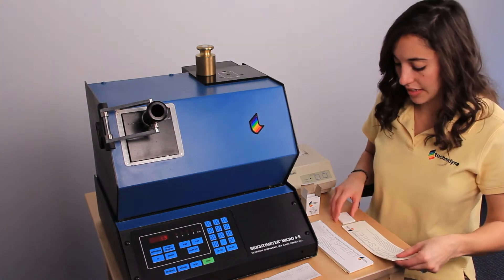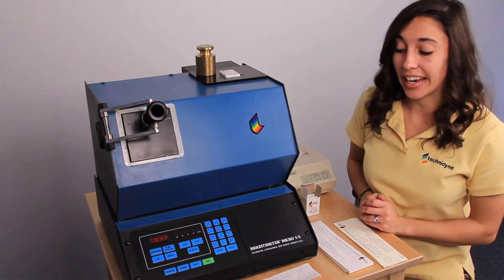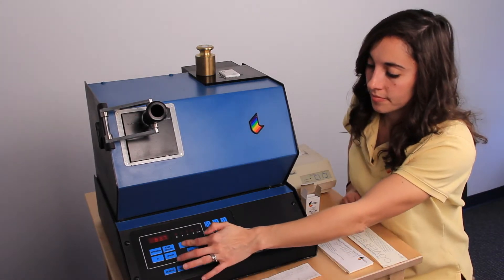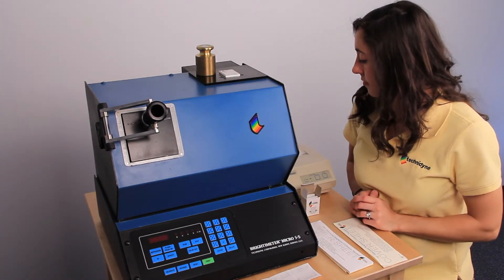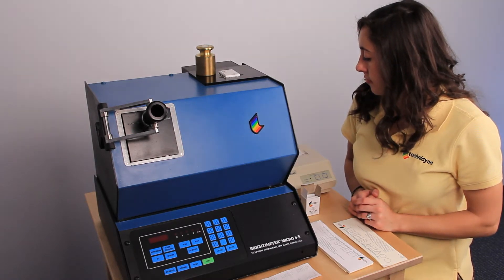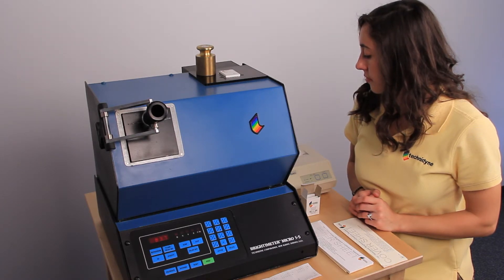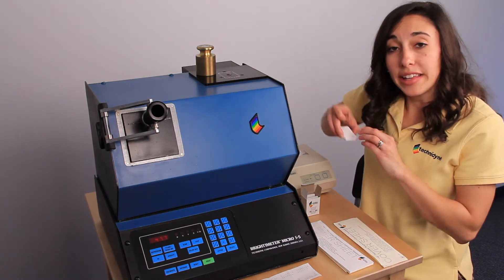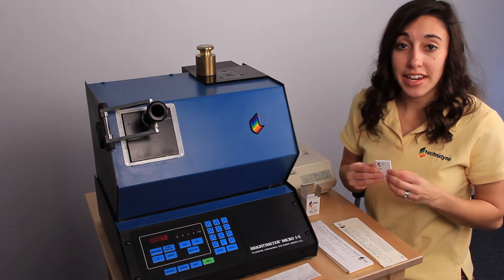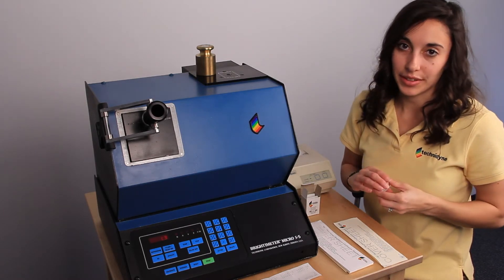Finally, we're going to load our working standard and press scan. You can write the values given along with today's date under brightness and values on your standard. And your calibration is complete.